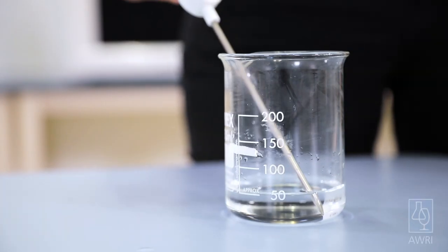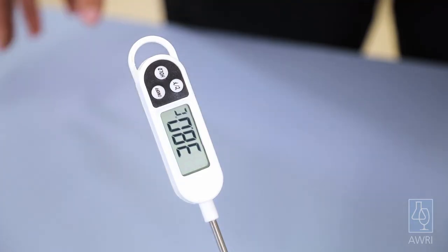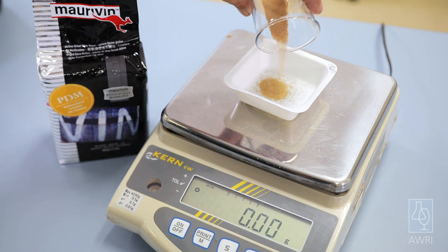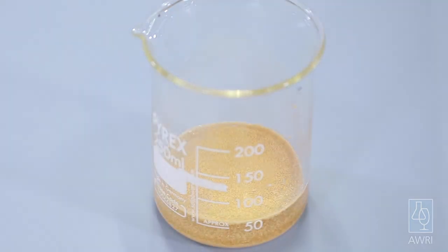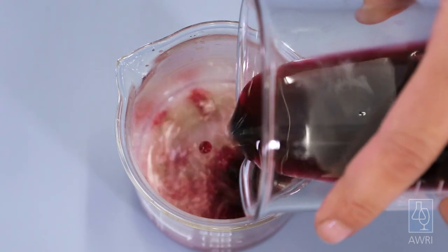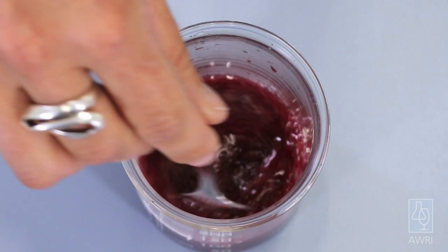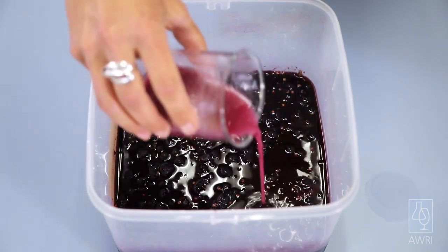To prepare the yeast for the ferment, warm about 50 millilitres of deionized water to around 38 degrees Celsius using either a kettle or a microwave. Add the sugar, mix to dissolve, then weigh out the yeast and sprinkle onto the water. Leave this for 10 minutes to allow the yeast to rehydrate. Stir the yeast, then add 50 ml of must to the yeast and leave for another 10 minutes. Make sure the crushed grapes and the yeast culture are both around room temperature before pouring the culture over the grapes.